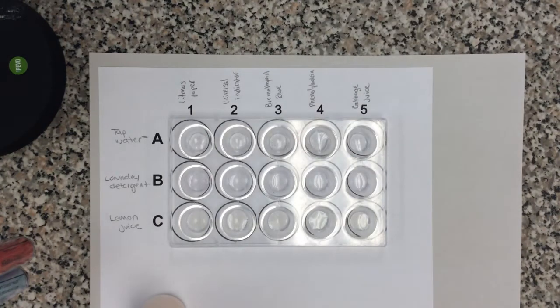Awesome. All right, so first thing we're going to do is start with my litmus paper.